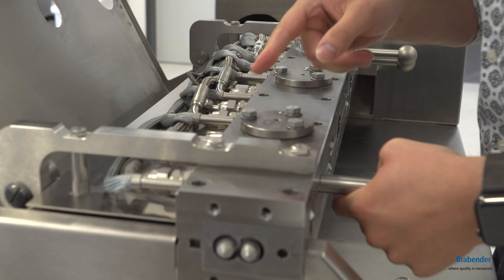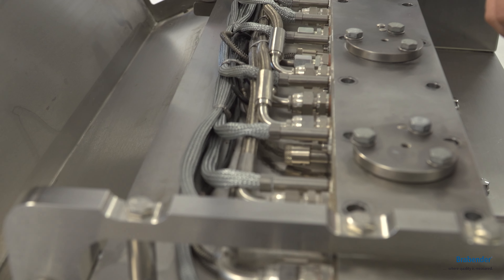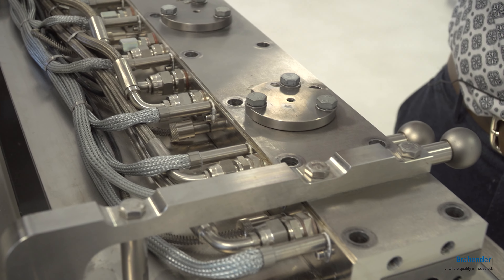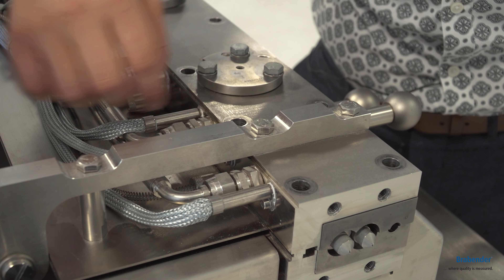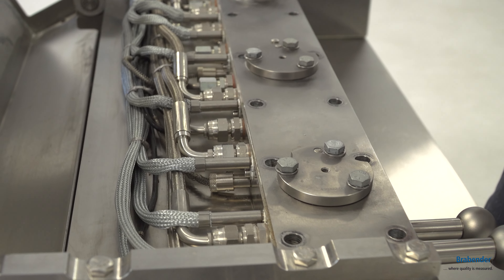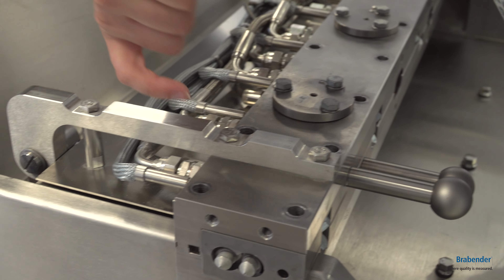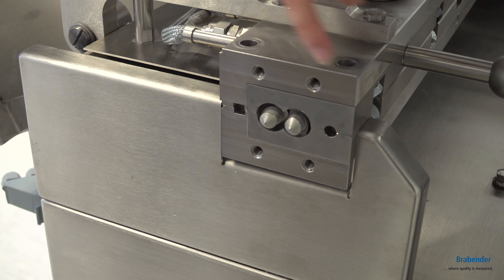When you look here you can find all the cables and connections for the heating and cooling system for the whole compounder. You don't have to detach every cable and every connection to open the liner, because these connections are placed inside the liner carrier and not in the liner.